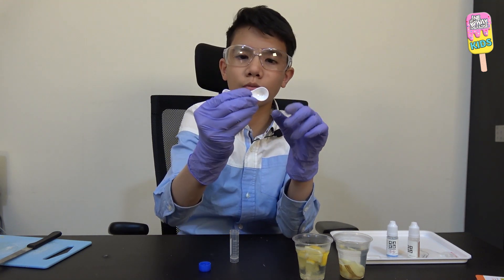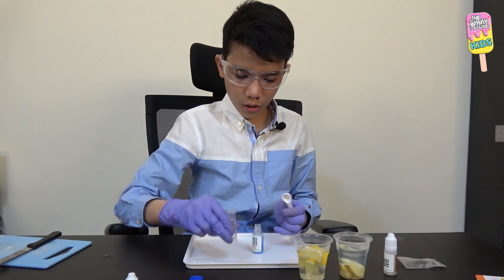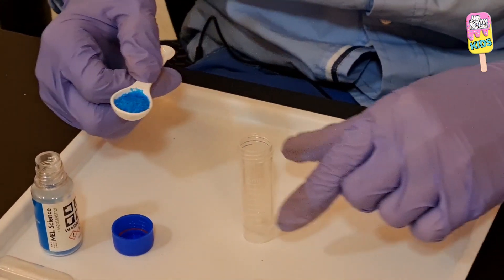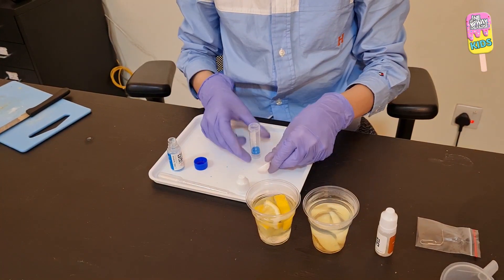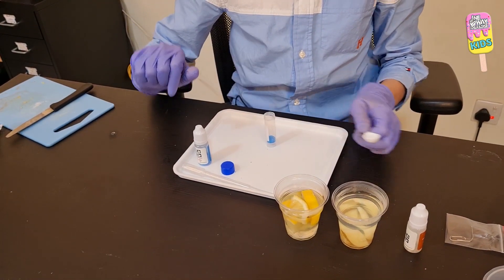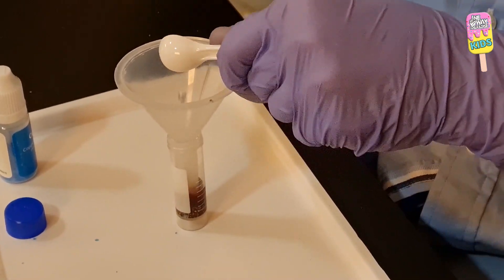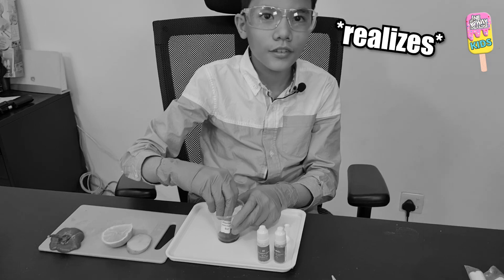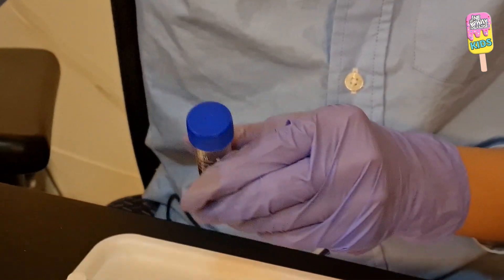Using the double-sided measuring spoon, I'll get one big spoonful of copper sulfate and put it into the plastic vial. I'll use a funnel to avoid spilling. Now I'll add two big spoonfuls of potassium iodide — make sure to avoid inhaling this. Then I'll close the vial tightly and vigorously shake it for 10 seconds.